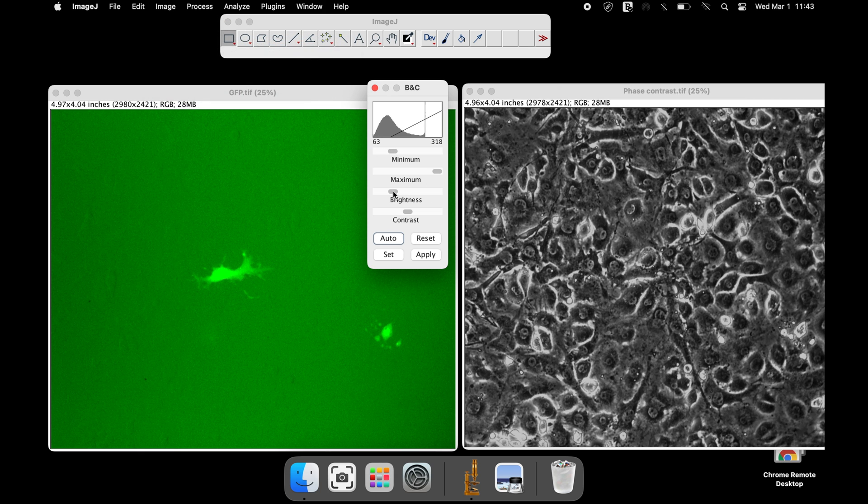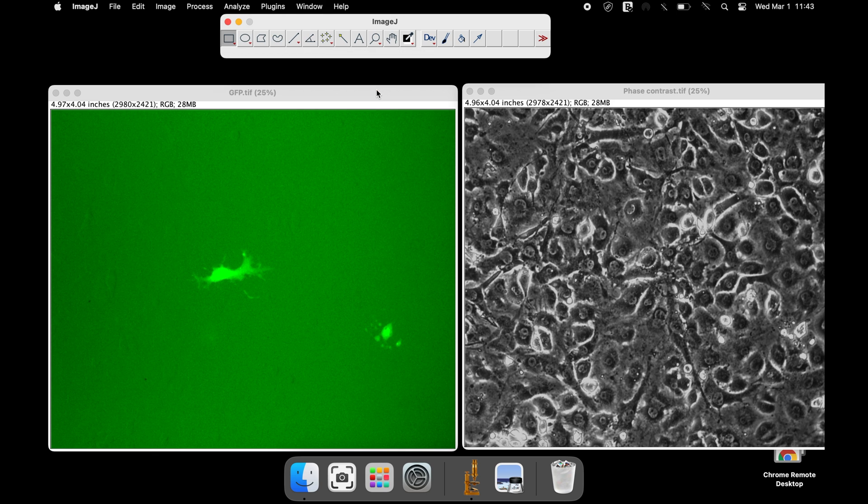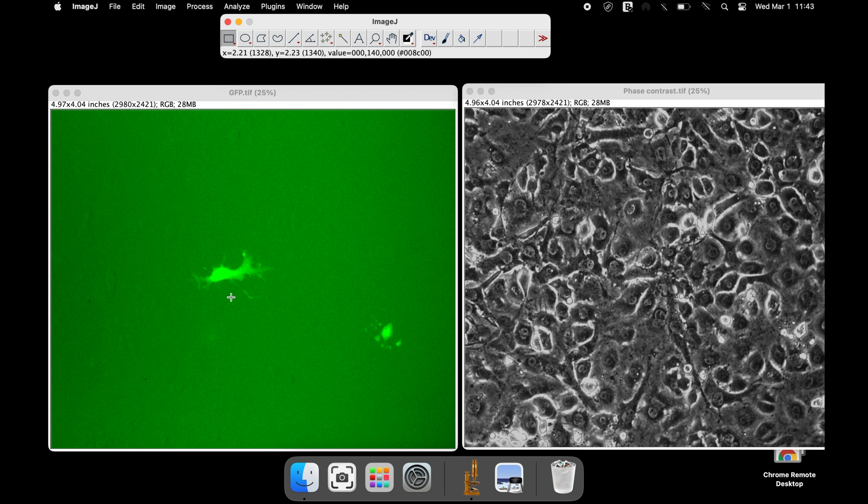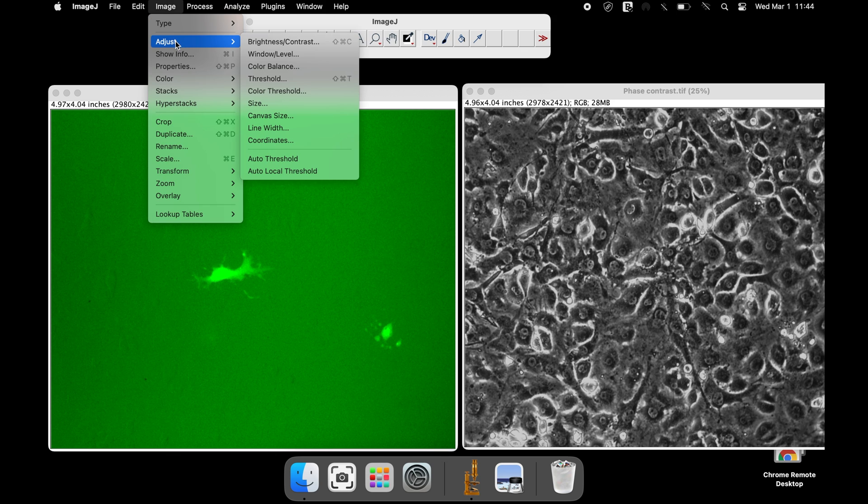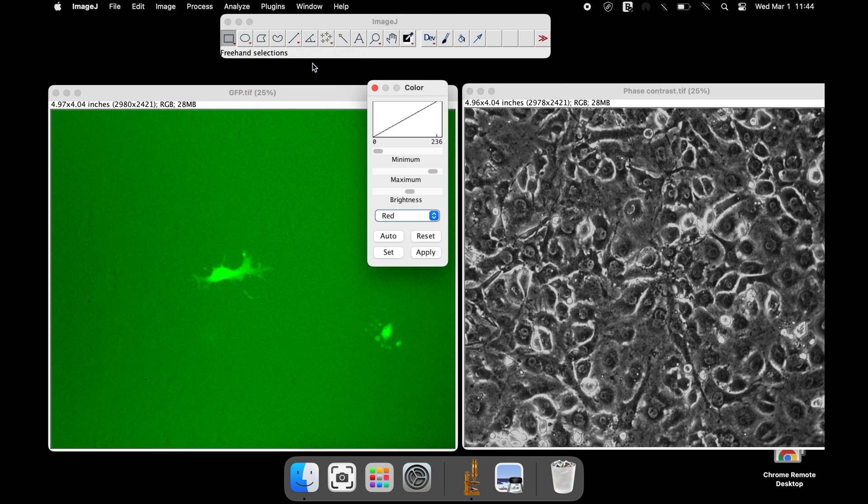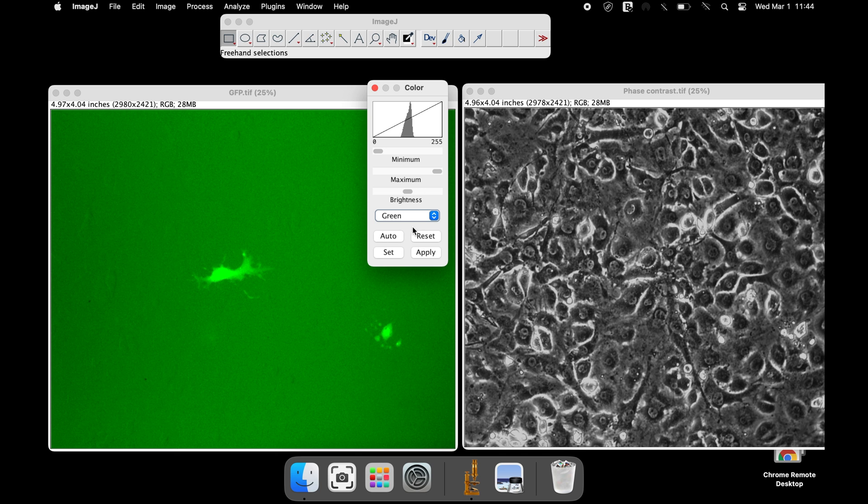If desired, the green background in the GFP image can also be modified. To do this, select the image and click Image, Adjust, and Color Balance. From the drop-down, select green and adjust the minimum, maximum, and the brightness levels accordingly.